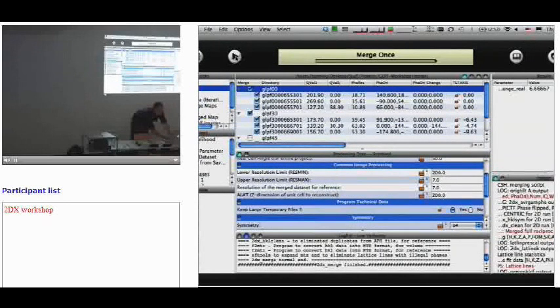So now we have a reference that is slightly three-dimensional because it has the 30-degree tilt pictures in there. And I can do this in a few iterations. So merge it together and refine the pictures, and merge it and refine it. And the more pictures you have and the finer steps you do, only fine alignment at the end of the phase origins, the more iterations make sense. So up to 10 or 20 or so. Then it is longer than the time we have here.